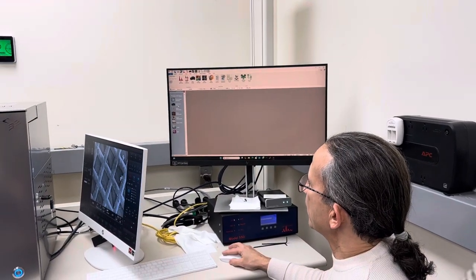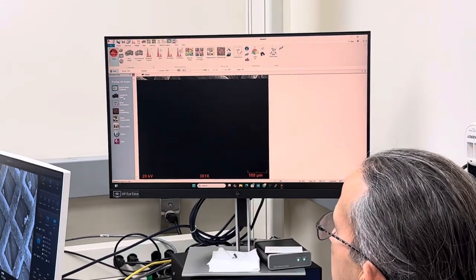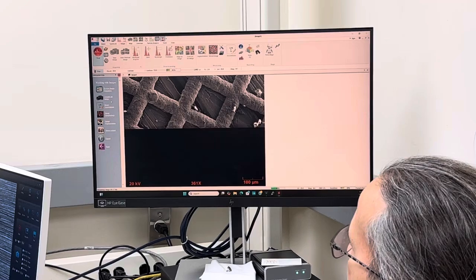So if I click on that and if I acquire an image, well, that's what I'm looking at over there right now.